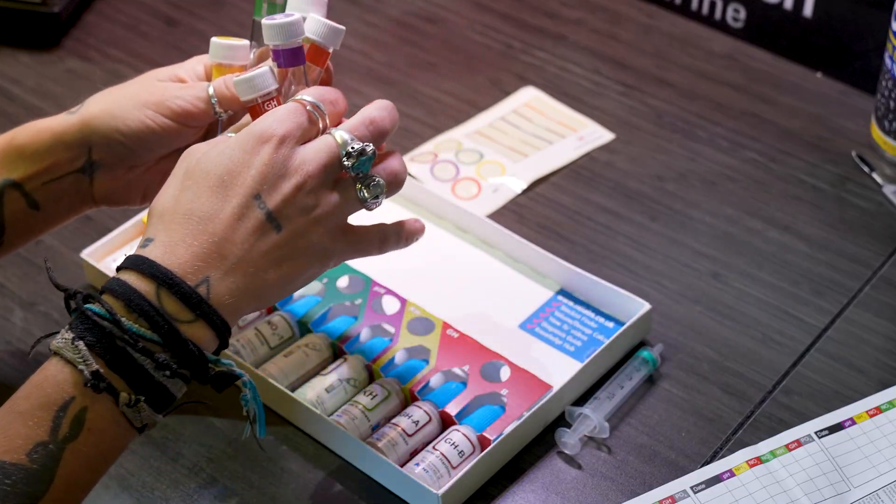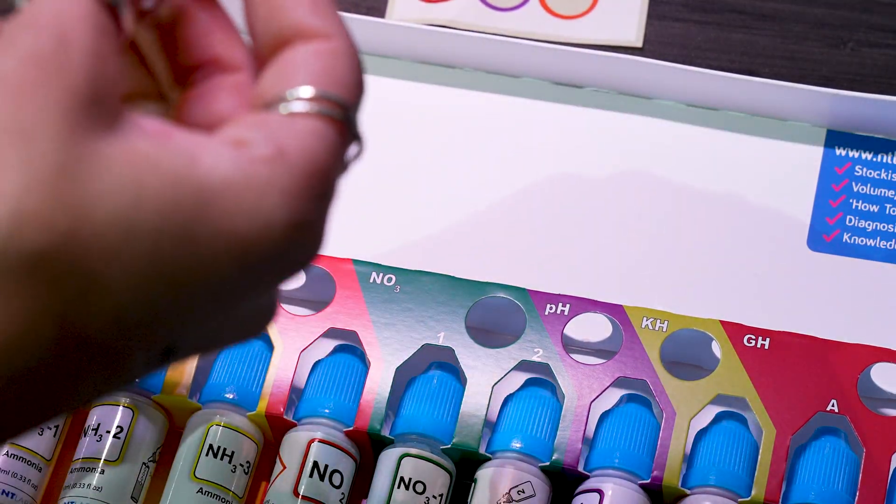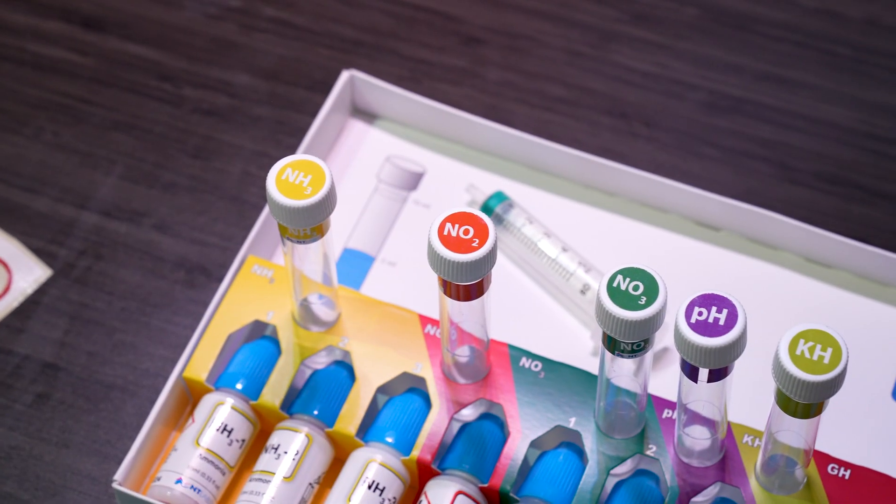Lately, I've just completely stopped using those test strips that you see everywhere. I just don't feel like I can rely on them when something goes wrong. With this kit, I can.